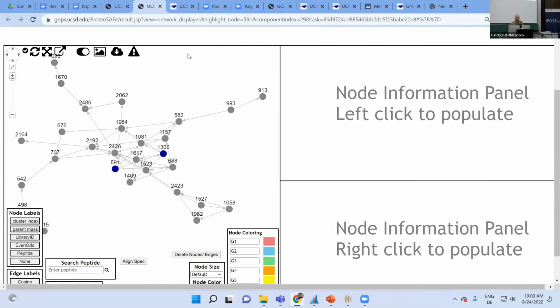Then just take another one as an example and explore it. Who got domoic acid? Okay, half. That was also an internal standard, so we spiked that. Maybe we could revisit the settings a little if it's not in there. But anyway, to move on from here, I now have basically the chemistry that was observed by MS/MS and is similar to domoic acid captured in this view.